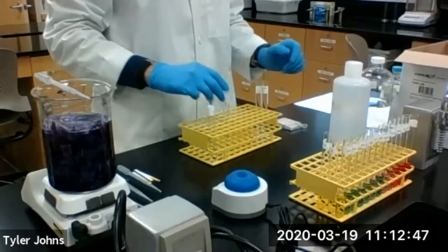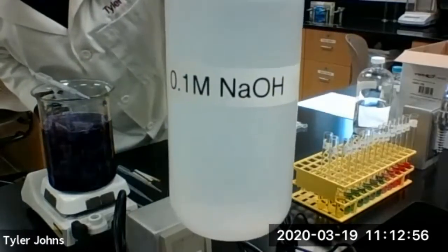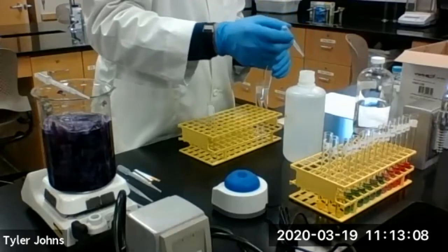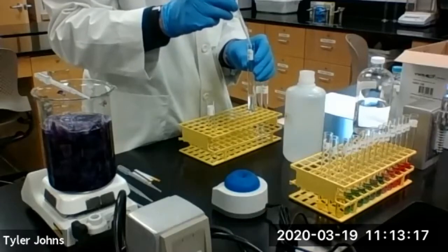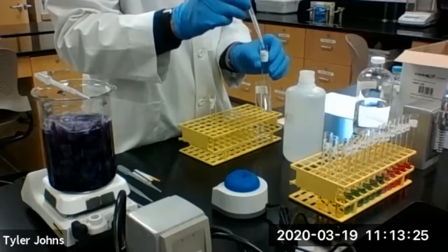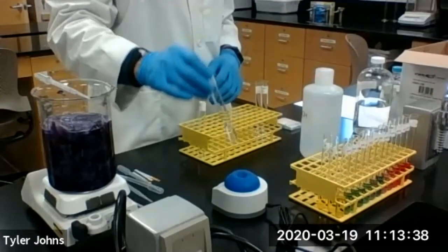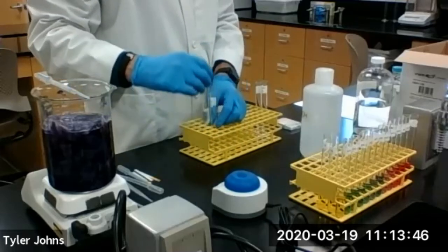Okay, we are now going to add 5 drops of 0.1 molar sodium hydroxide. So we have our 0.1 molar sodium hydroxide. We will be adding 5 drops of this to our other test tube with deionized water. Five drops. And we'll also be adding 5 drops of this to our other test tube of pH 7 buffer. We'll mix.